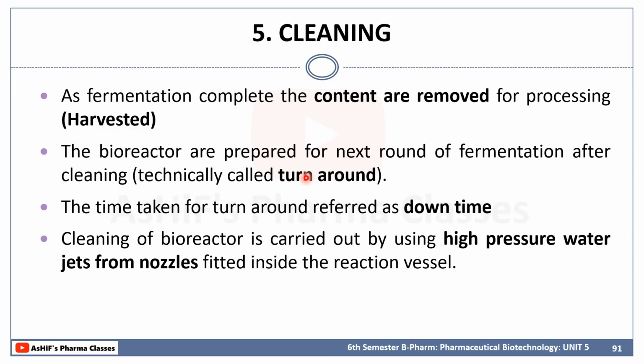And finally the last step is cleaning. Once the fermentation process is over, after a specific period of 5 to 10 days, all the content is removed. This removal of content from the fermenter is known as harvesting.